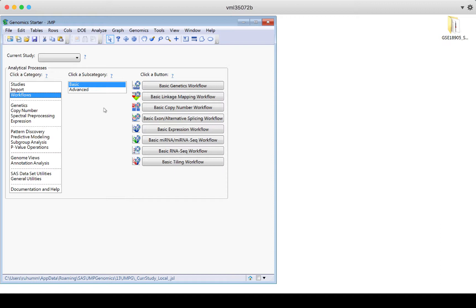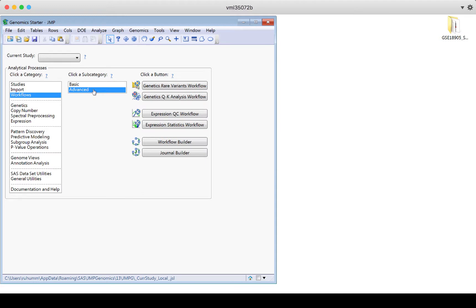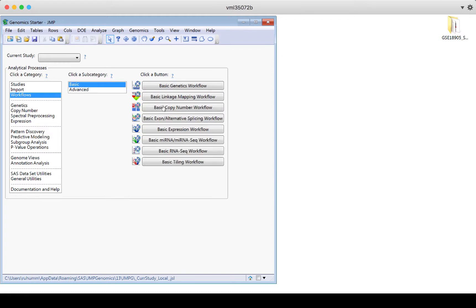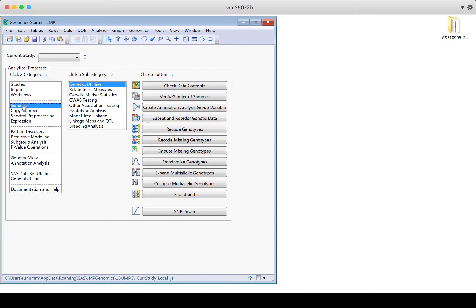However, many researchers will want to tailor their process beyond what's included in these workflows. There are basic and there are advanced workflows. And again, they're pulling from a number of these features, these analytical processes that show up in the categories here or the subcategories. So the basic genetics workflow is going to contain many things from this genetics list of categories and options.